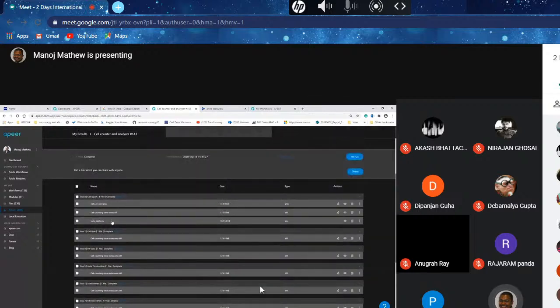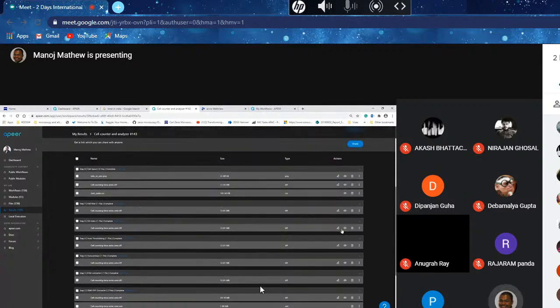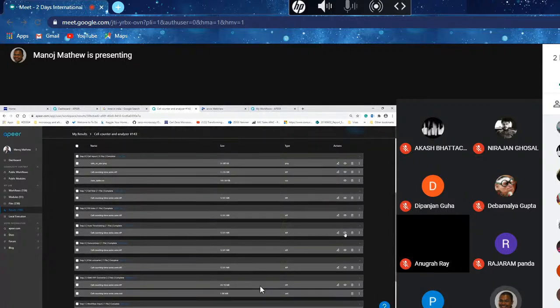In many cases, you don't need all the intermediate results. If that's the case, I can just delete this with this delete button. If I want to take a look at one of the intermediate results, I can press this visualization button here.